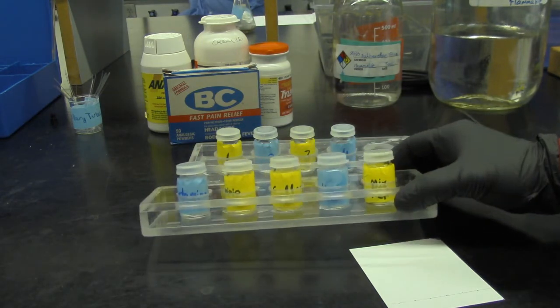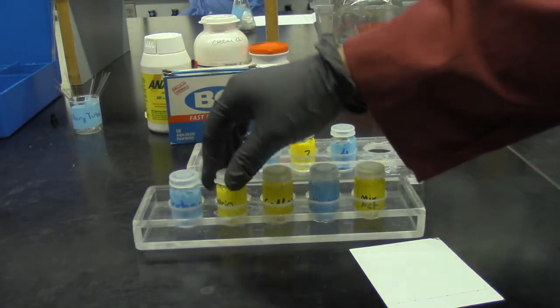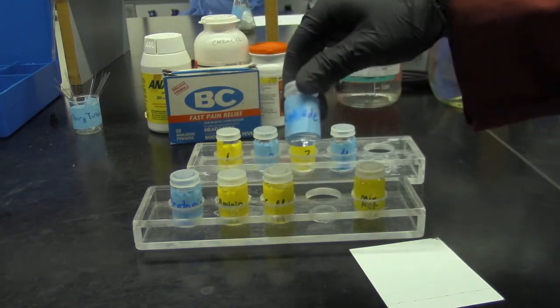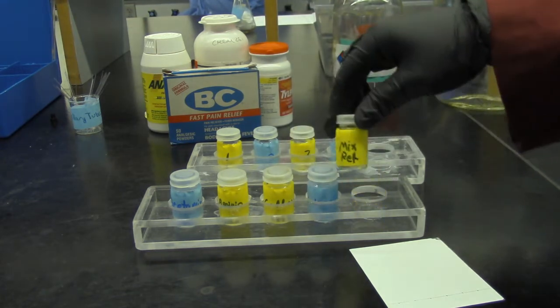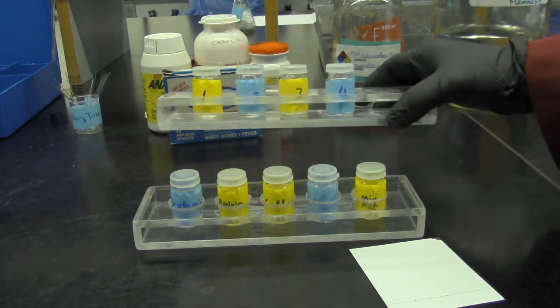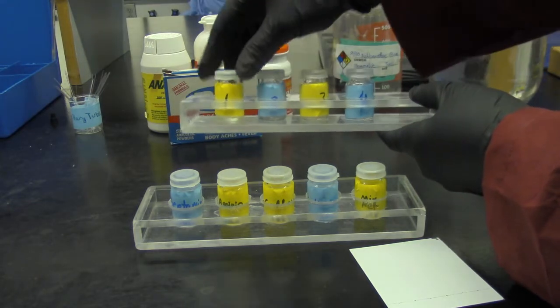So we are given a set of standards: acetaminophen, aspirin, caffeine, salicylamide, and a mixture of all these four, reference mixture, along with the four unknowns. These are unknown analgesic drugs, right?